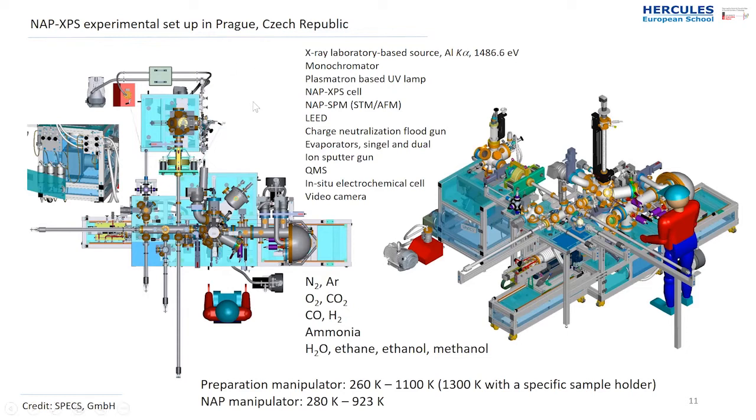The reason is that it's quite tricky if you combine those techniques together. STM is very sensitive to vibration. Now imagine you have a lot of systems working around, pumping. So it's tricky, and we always have to manage our measurements. But so far, it has worked.